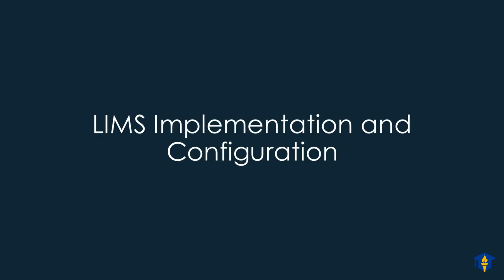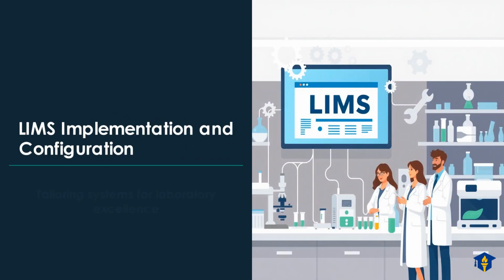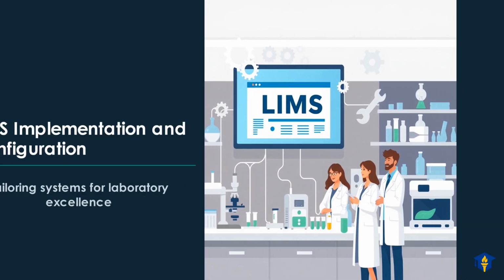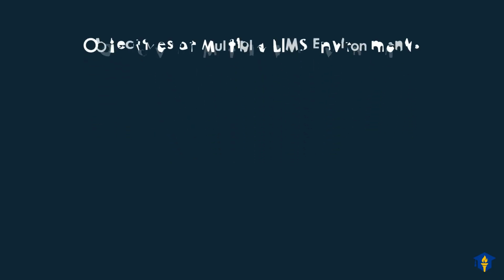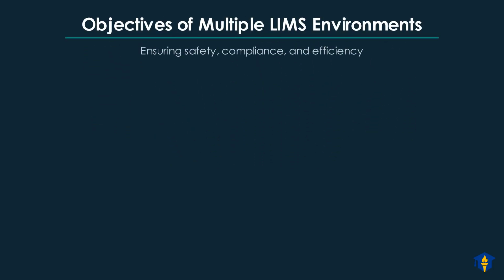We'll start by introducing our topic, which is about LIMS implementation and configuration. Our goal is to tailor these systems effectively, ensuring they lead to excellent laboratory operations. We'll discuss the key objectives behind using multiple LIMS environments in a laboratory setting. This strategy is crucial for ensuring safety, maintaining compliance, and boosting overall operational efficiency.